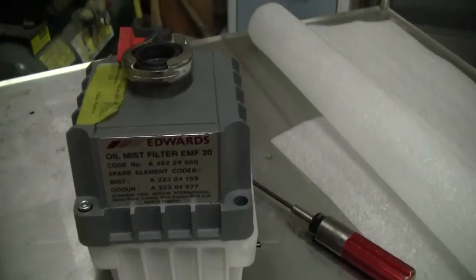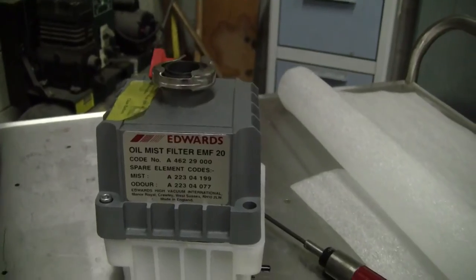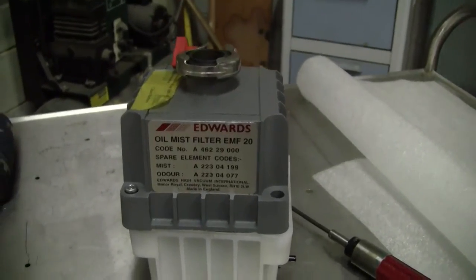Hi, this is Michael Nightow from Hitech Trader. Today we're looking very quickly at an oil mist filter by Edwards. The model number is EMF20.